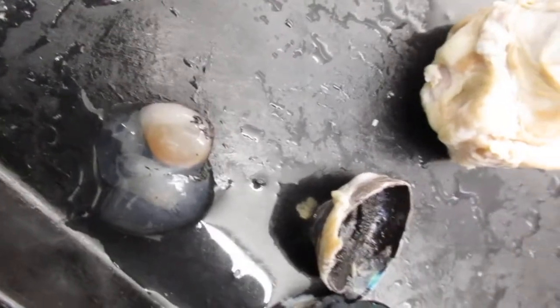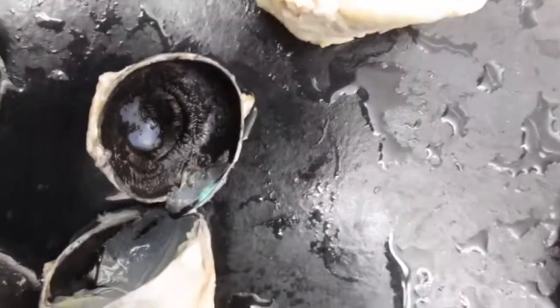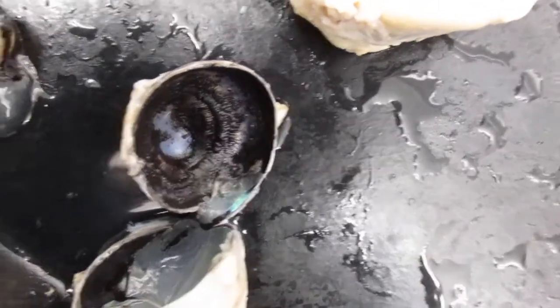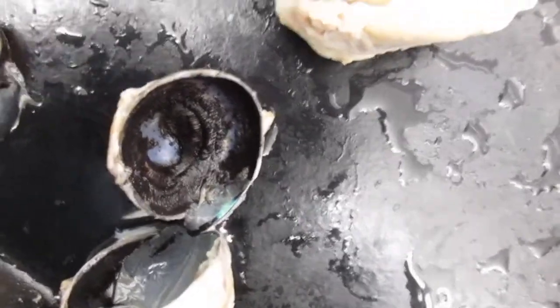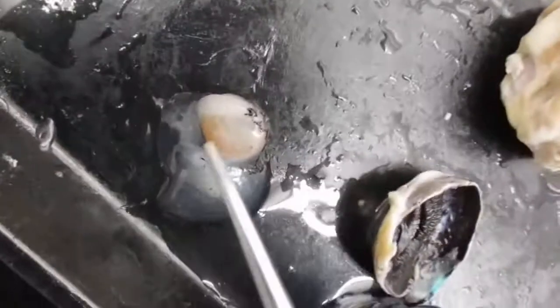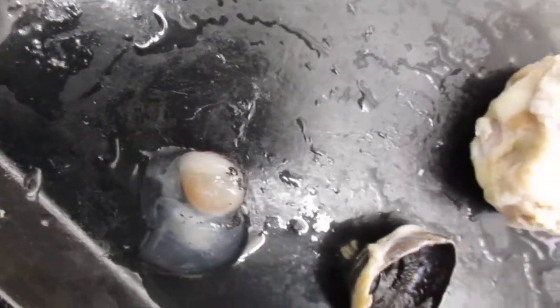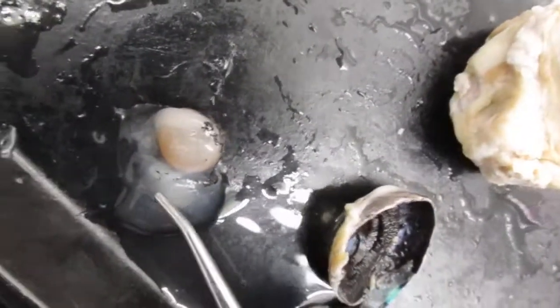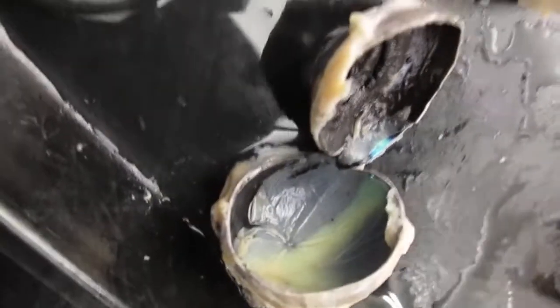So just like the iris right over here, which is going to control the size, or I should say the diameter, of the pupil, controlled by sympathetic and parasympathetic innervation, the lens is going to do the same. It's going to be controlled by your parasympathetic and sympathetic innervation. So this is your vitreous humor here. This right here is the retina, as I've already mentioned.